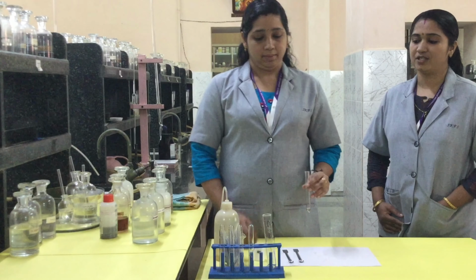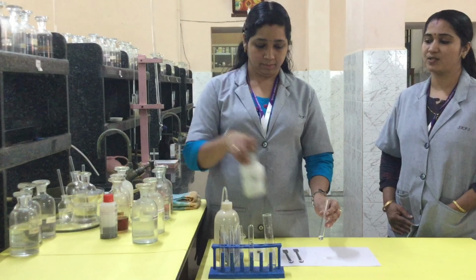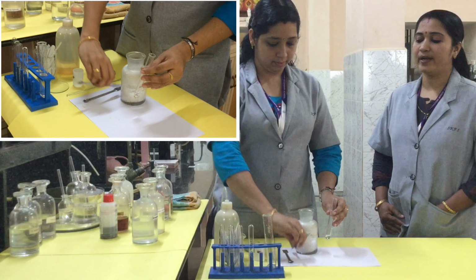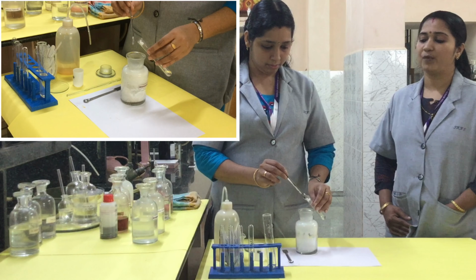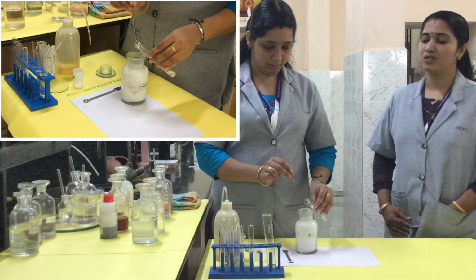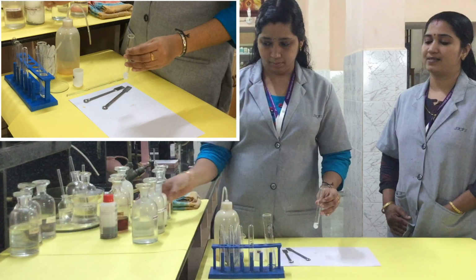For the group reagents, first of all, we have to take the salt solution in a test tube and add solid ammonium chloride. The group reagents in this experiment are ammonium chloride, ammonium hydroxide and ammonium hydrogen phosphate. First we add solid ammonium chloride to the salt solution taken in a test tube and make it saturated.